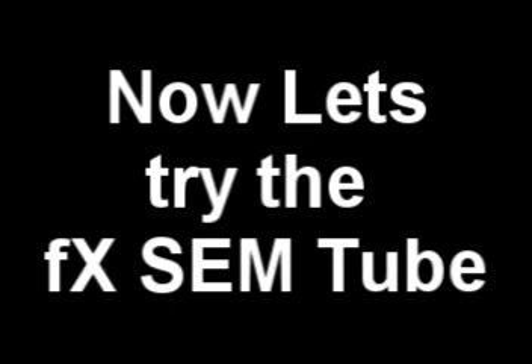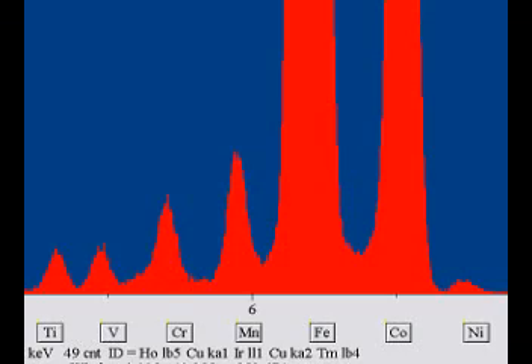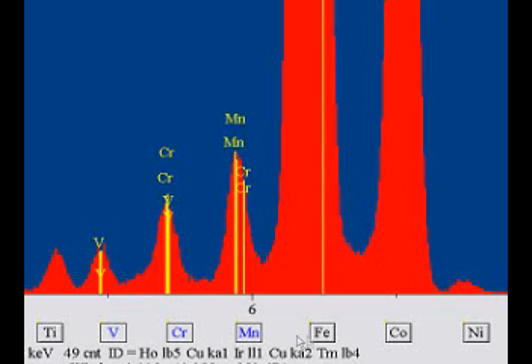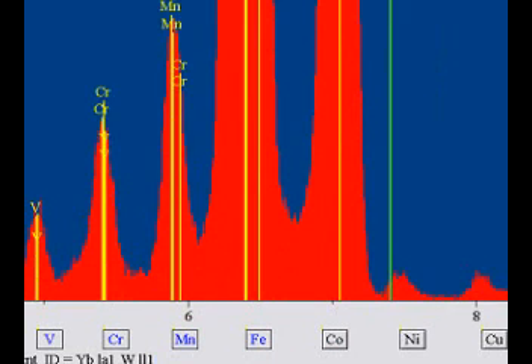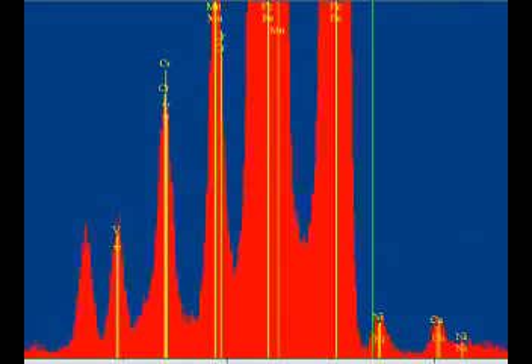Now let's try the fX SEM tube. X-rays on, lights on — trace vanadium, chrome, manganese. Nickel and copper are well present with peaks 10 times the size of the other peaks.